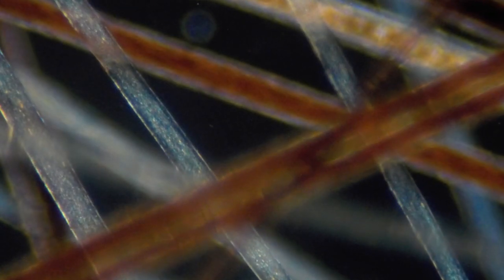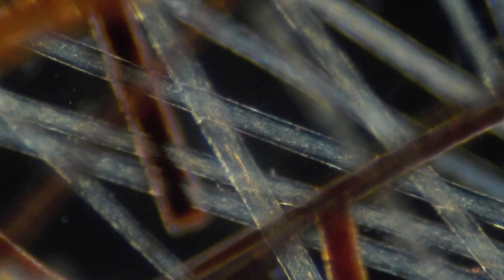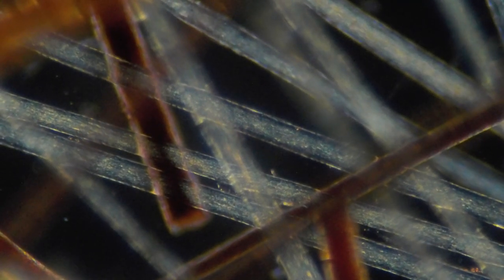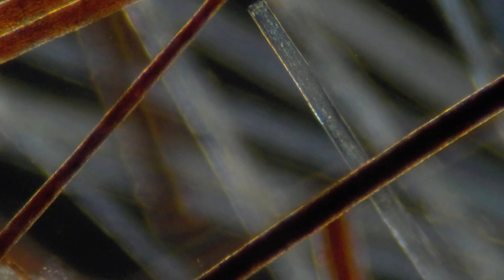I'm a little bit out of focus and I'm focusing now and I also increase the magnification and you can see that some of these protein fibers are actually transparent a little bit and you can also see the surface texture of these fibers. So that's quite a nice and interesting specimen to observe. Here's another place. And when you actually magnify that much then sometimes those structures that appear to be opaque start to become transparent because the bright light is able to shine through it. And now you can actually see at a yet higher magnification you can actually see into these fibers.